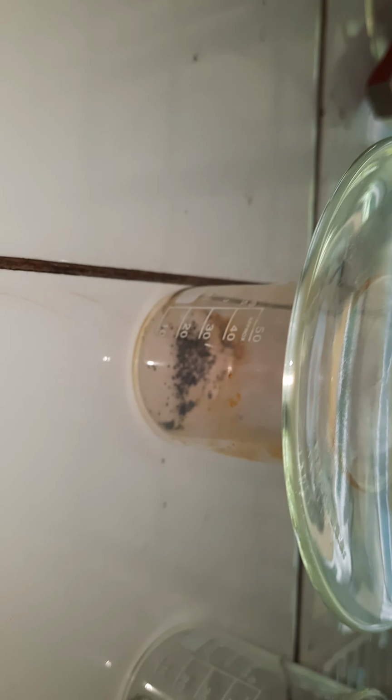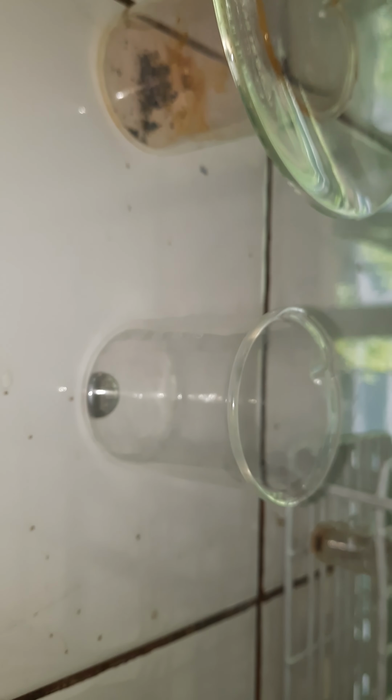Okay, if you could notice, I put a cover, a watch glass, to cover the beaker containing the iodine crystals, and I did not place that over the mercury metal. Okay, let's continue with this in a little while.